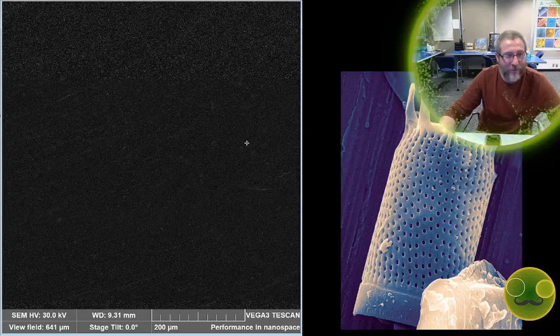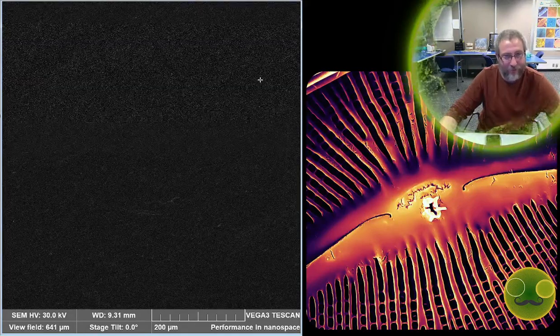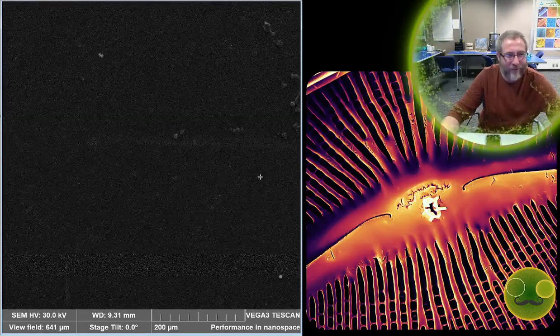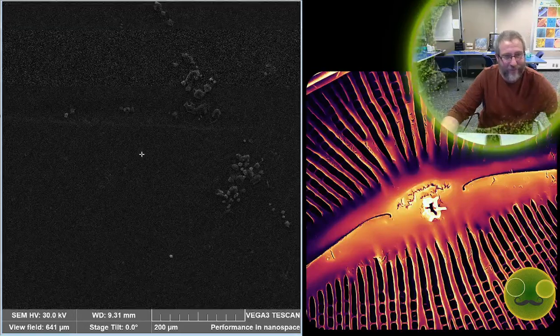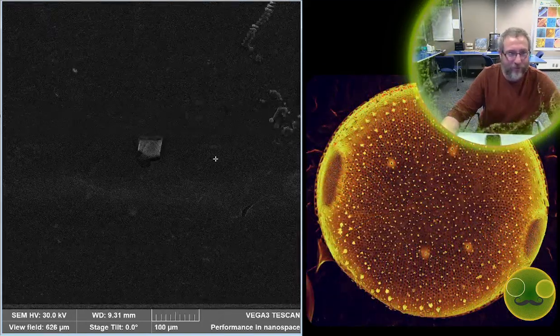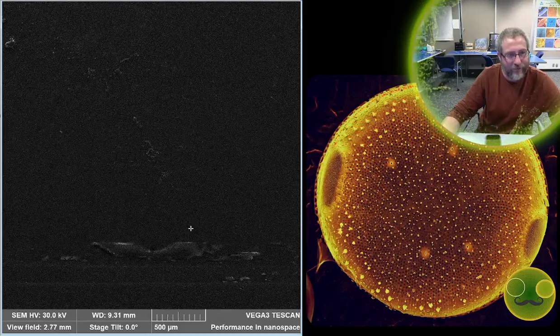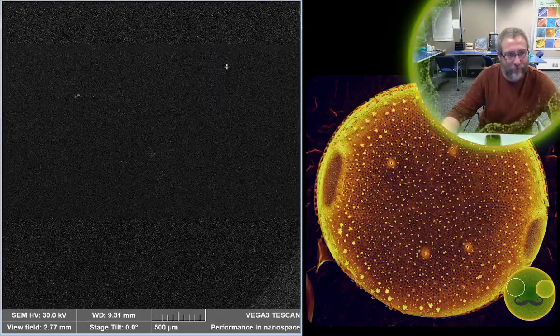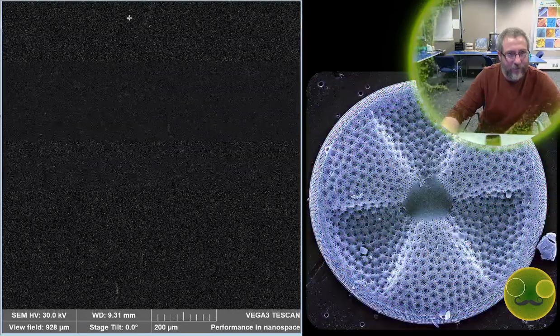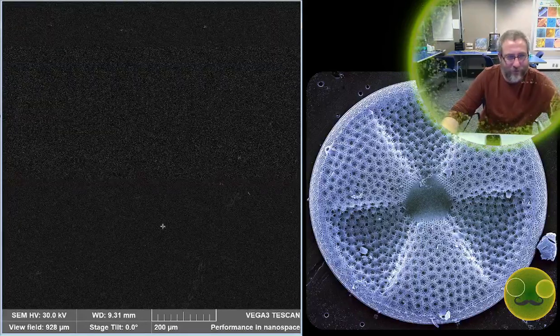So I think the way that the culturing is typically done is everything is grown from one organism. So they isolate just a single cell. And then everything we're looking at should have identical DNA, like absolutely identical DNA. They should all be clones. But you know, the longer they're in the tank together, that's when the weird stuff starts to happen, I think. I don't know where they were collected from or why they were collected, so I don't have that information.